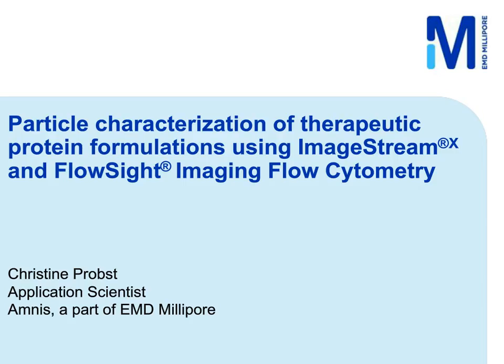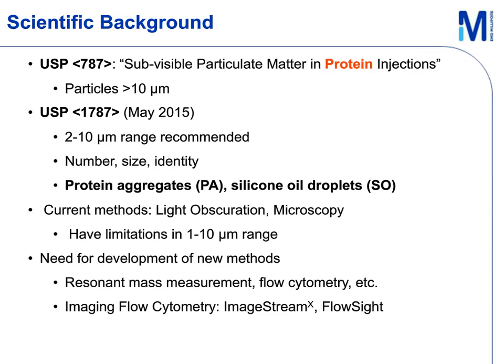Dr. David Volkin already did an excellent job of explaining why particle characterization of therapeutics is important and what some of the current analytical methods are. I just want to provide a brief scientific background in order to explain why we were interested in developing this application in the first place. So pharmaceutical companies are currently required to monitor particles within injectable therapeutics. Because the original concern was that particles may occlude blood vessels, limits were set for particles 10 micron and greater, because this was considered the minimum particle size for concern.